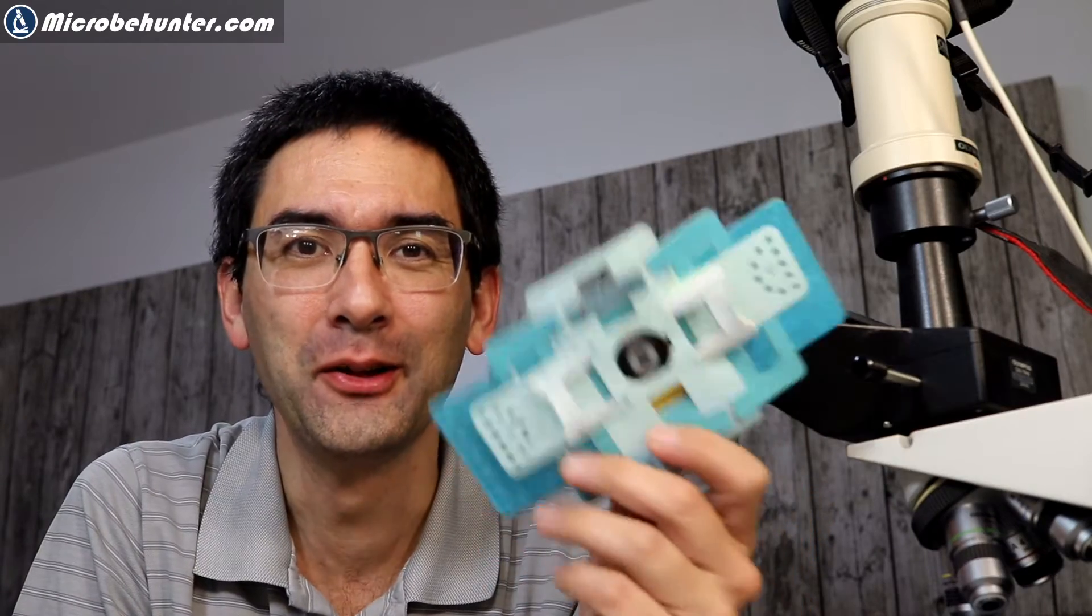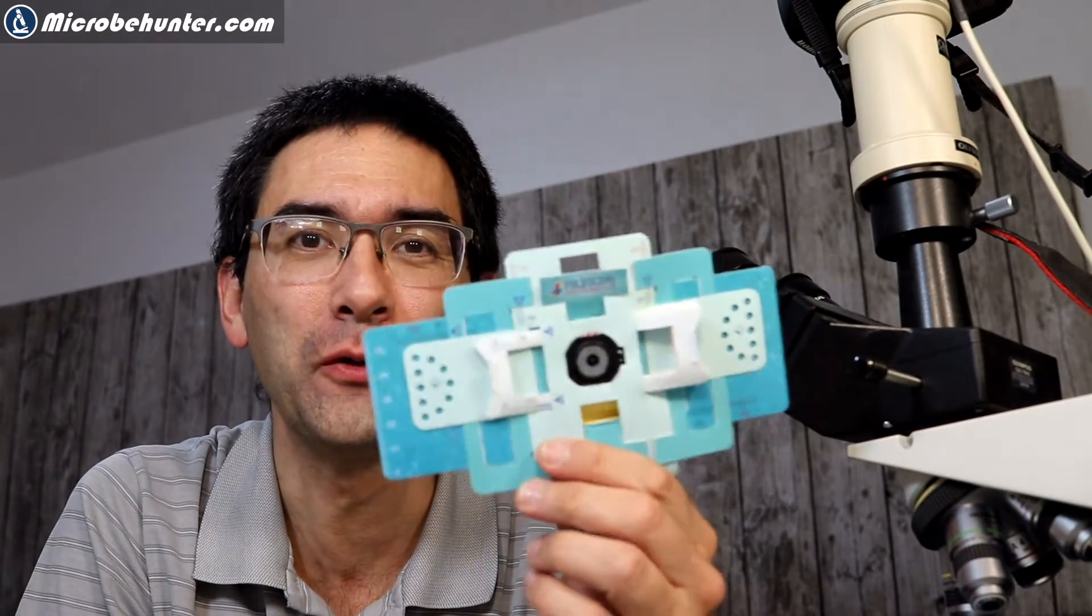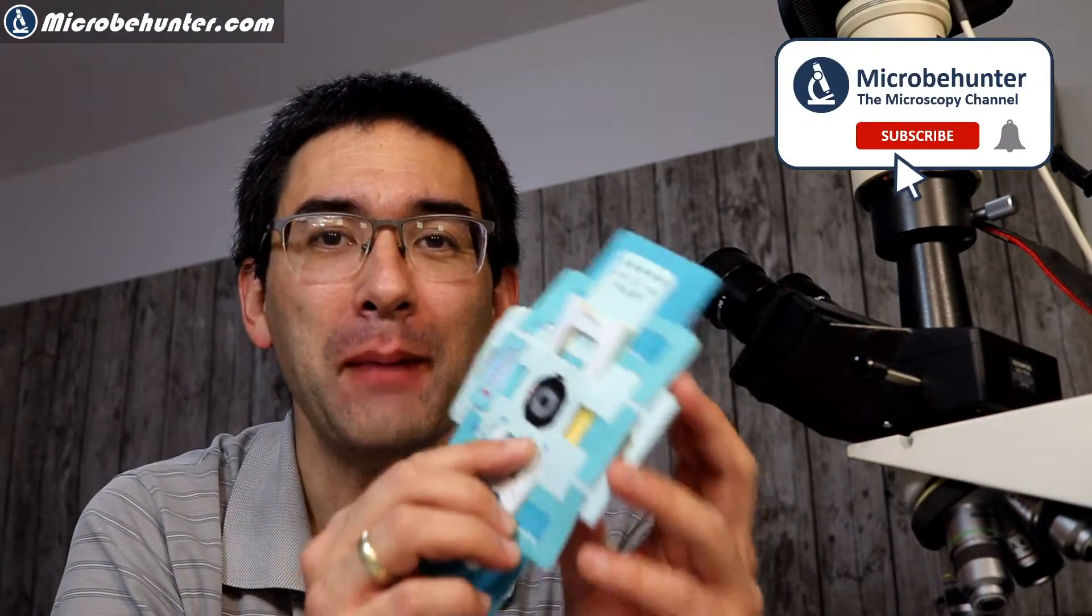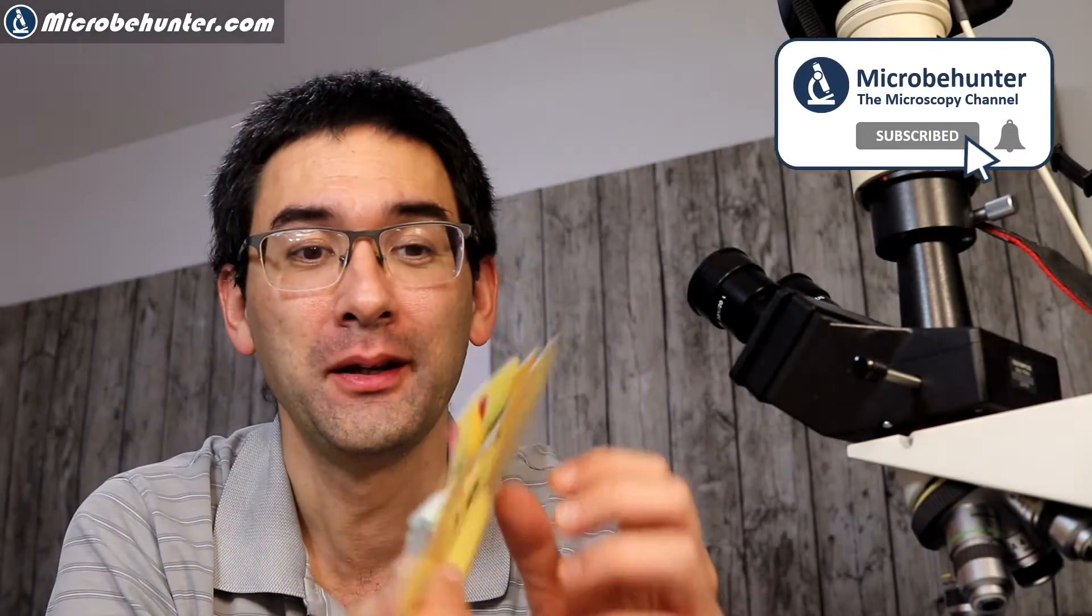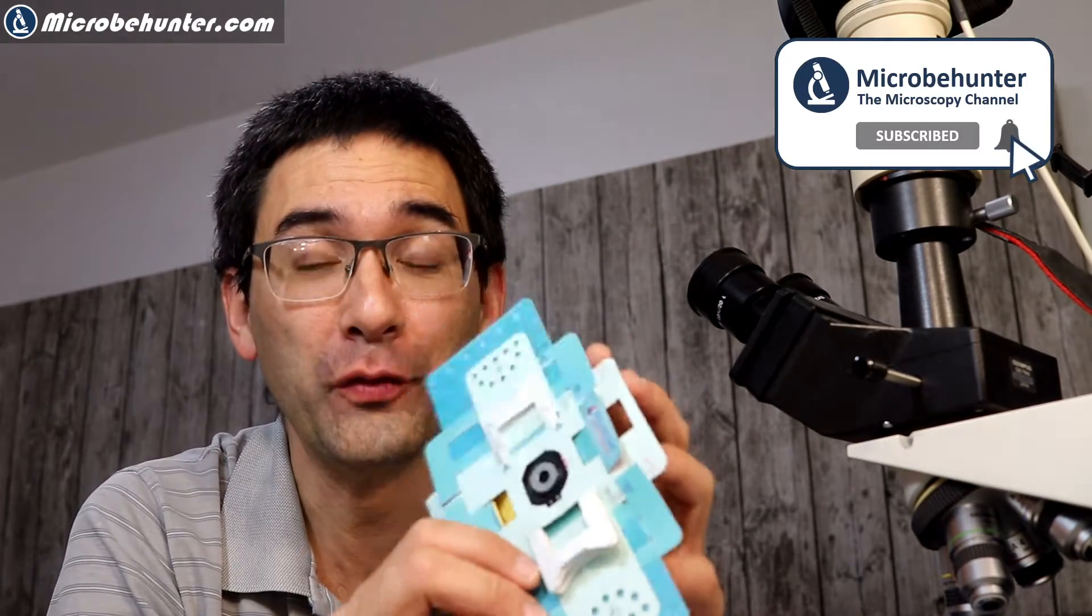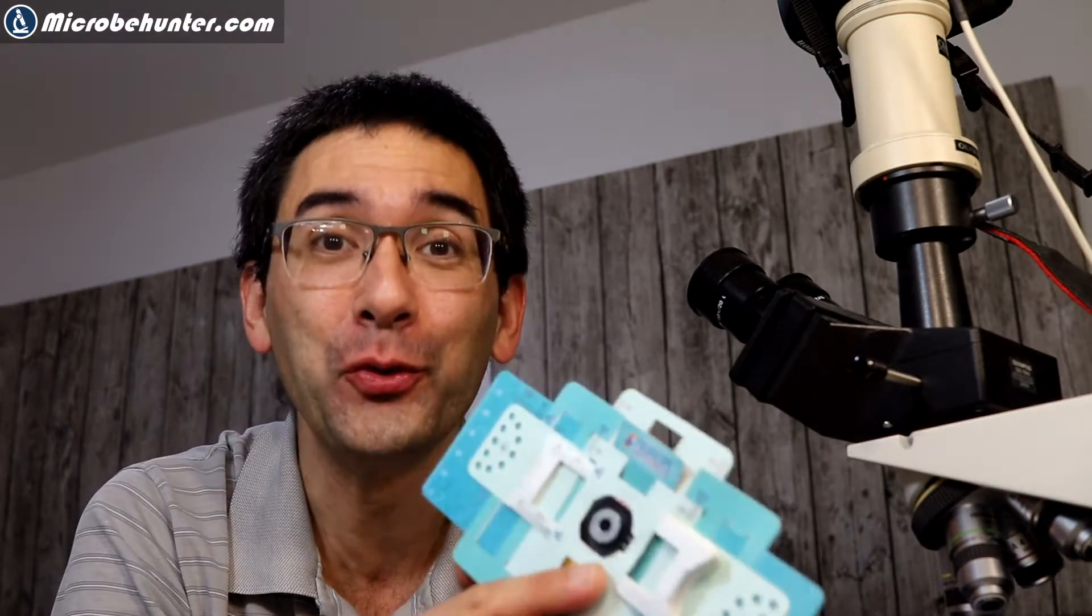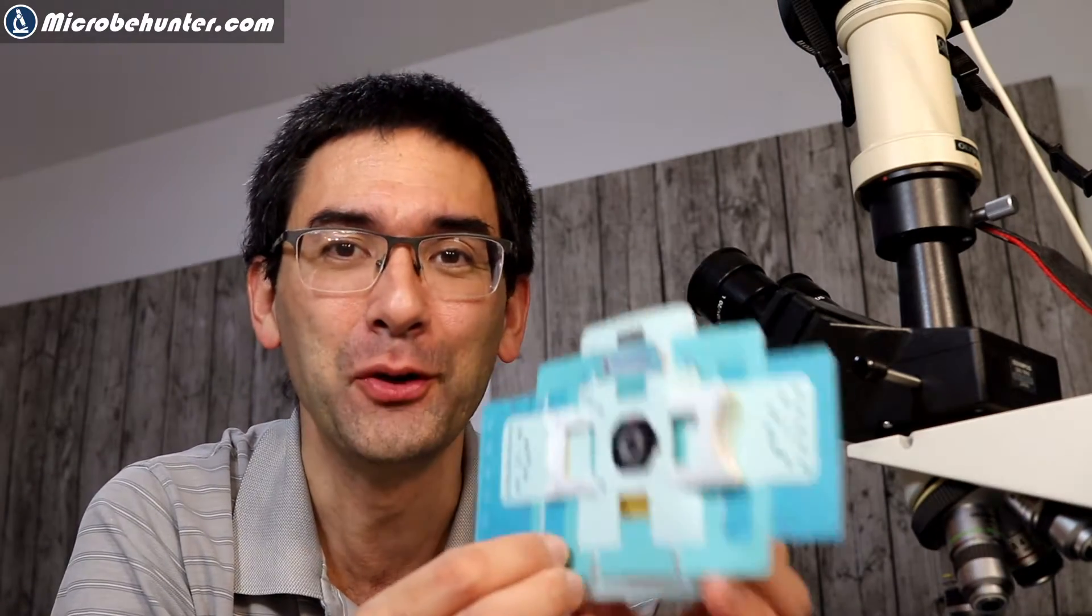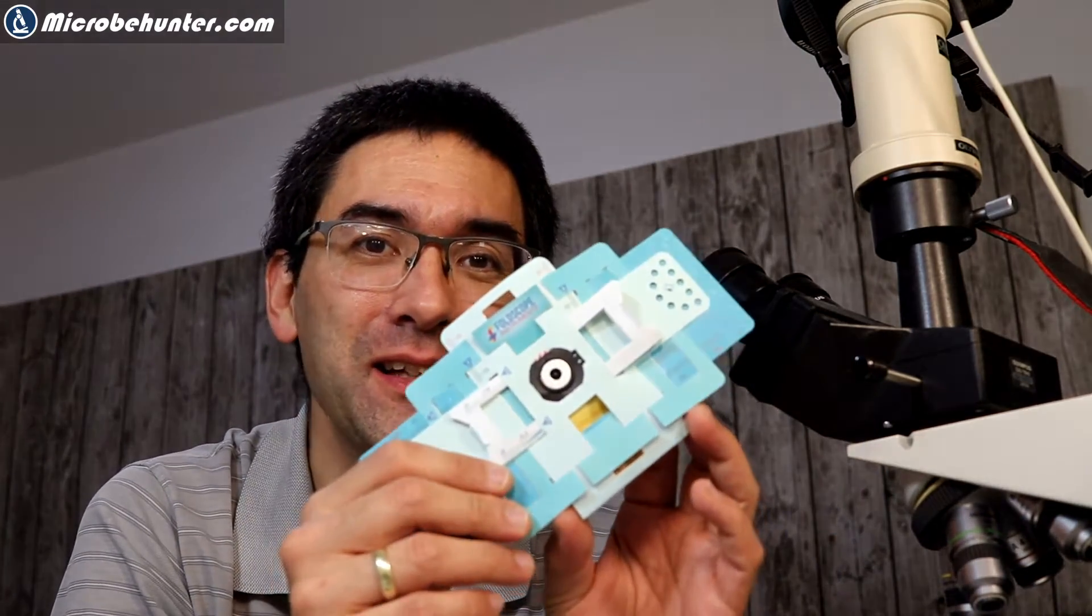So hi, Micropunter here again. Look what I got here. This is the so-called Foldscope. It is a single lens microscope and I got it. I bought it over eBay. I put it together. I want to show you in this video how I put it together and then I want to comment a little bit on this as I put it together. I think it's an interesting project. Let's get started.